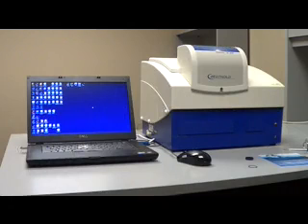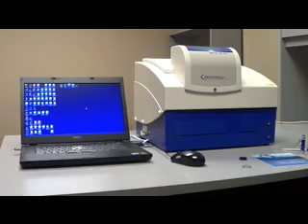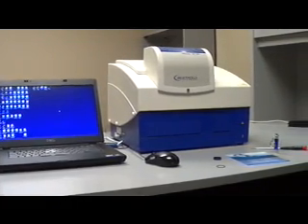Today we are going to learn how to replace or add an emission filter to the emission filter wheel on the Mithras LB940. This will also apply to the TriStar 1 LB941.